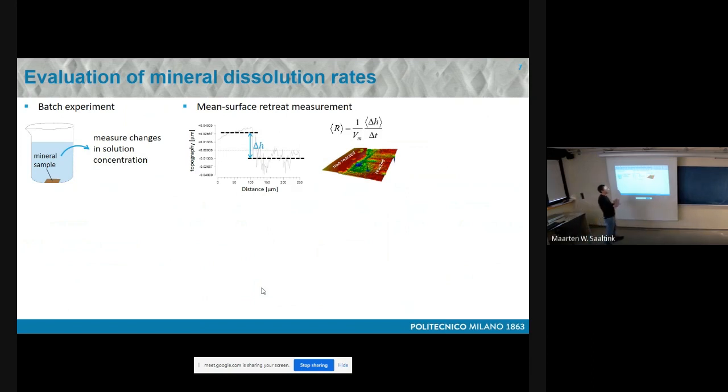So, why are we interested in that? Well, we start with the determination of reaction rates. In some cases there is quite a lot of work with batch experiments to ascertain reaction rates. And in some cases, reaction rates, either kinetics or equilibrium, obtained from batch experiments are then used in, for example, transport models, trying to mimic these kinds of reactions across porous systems.